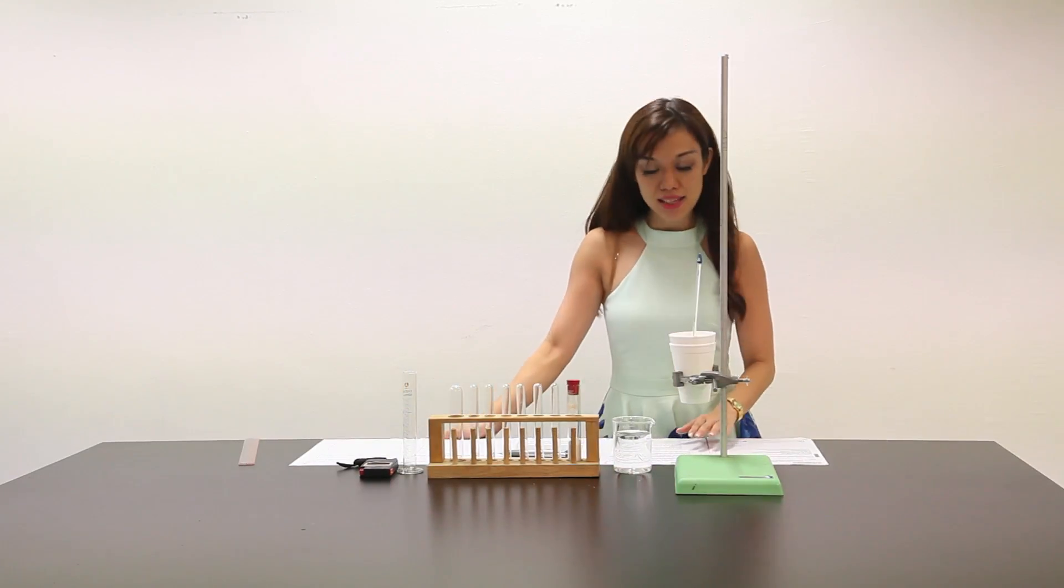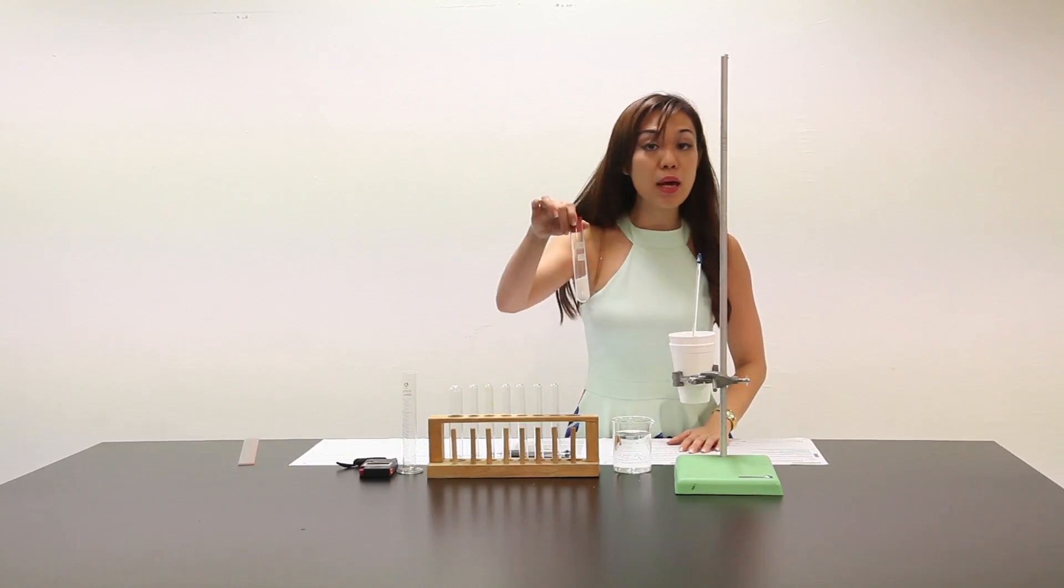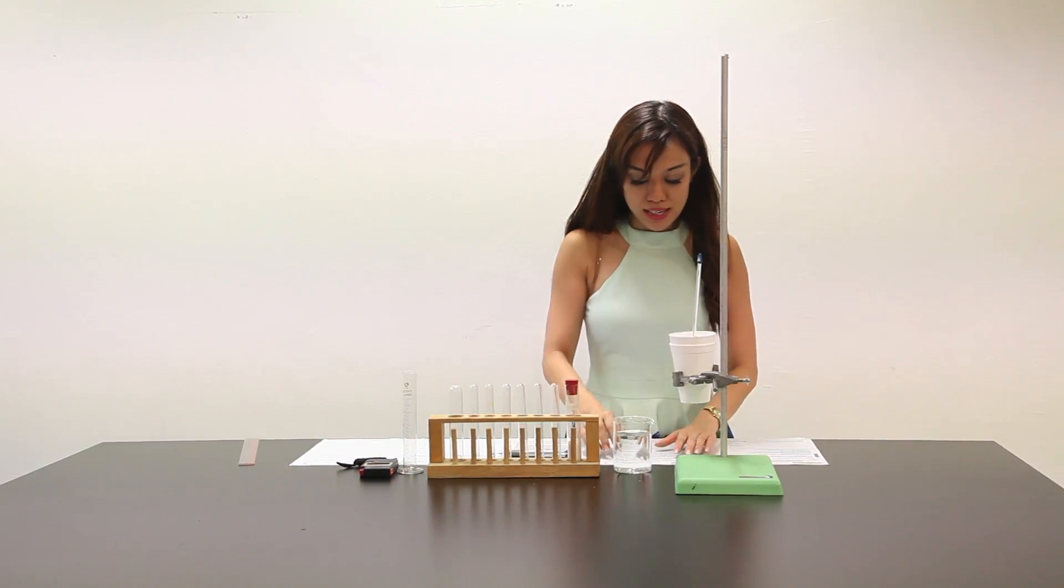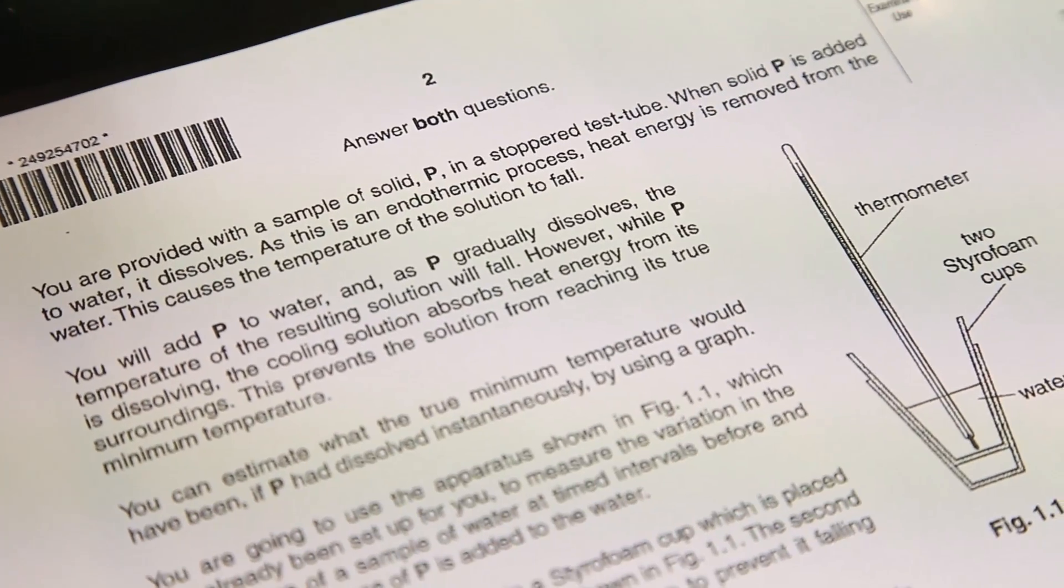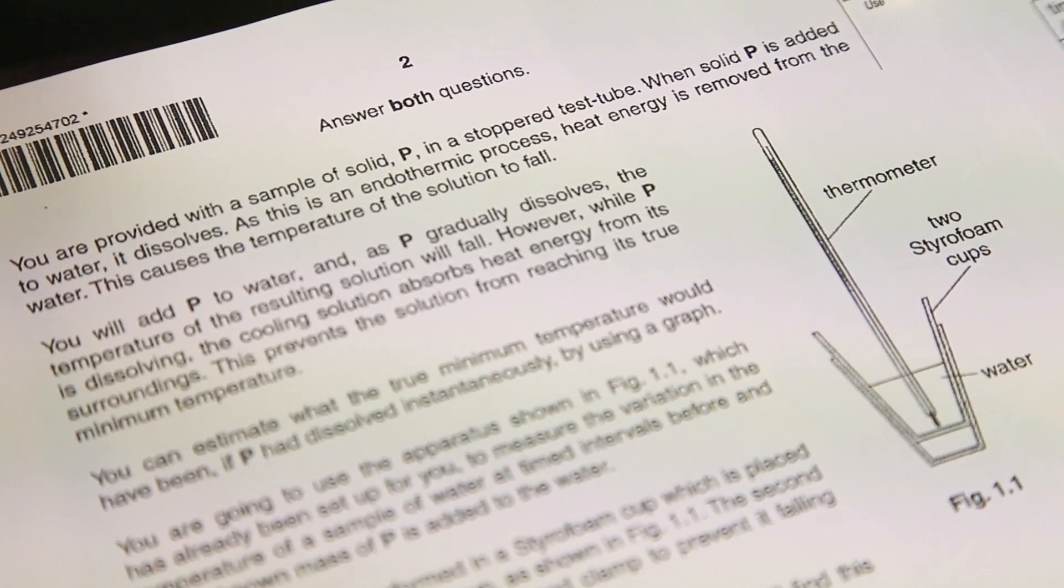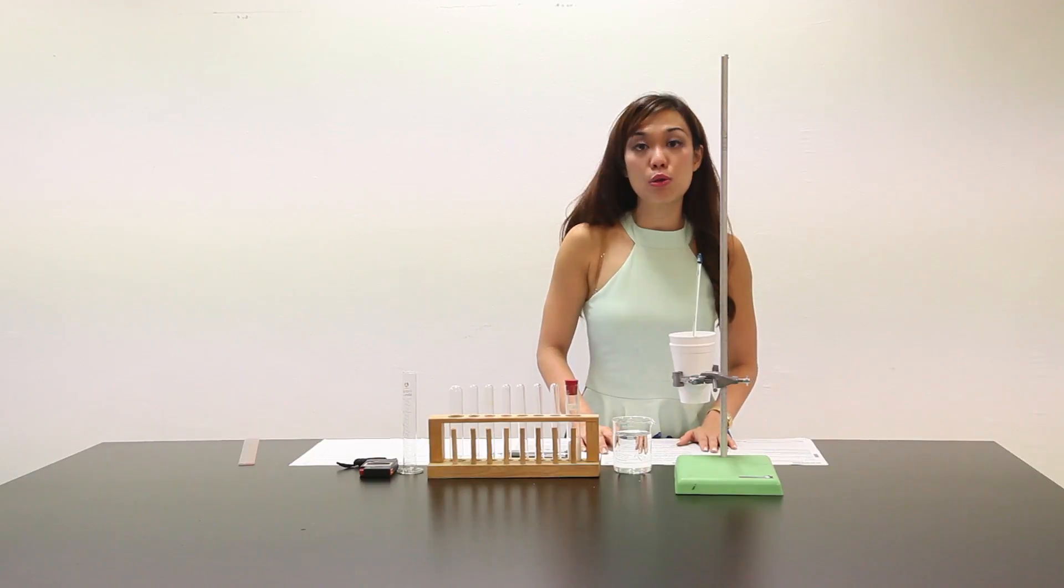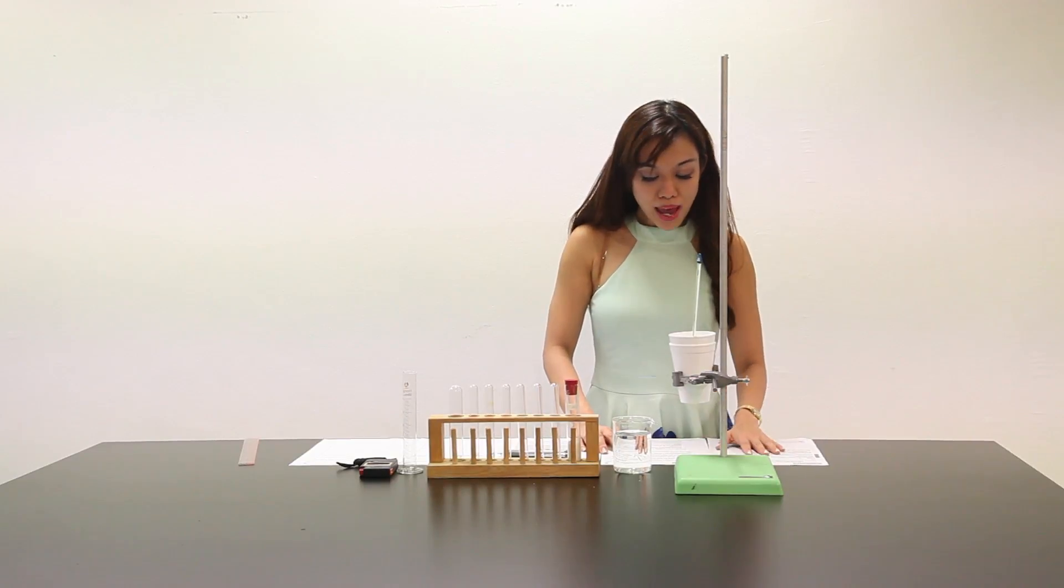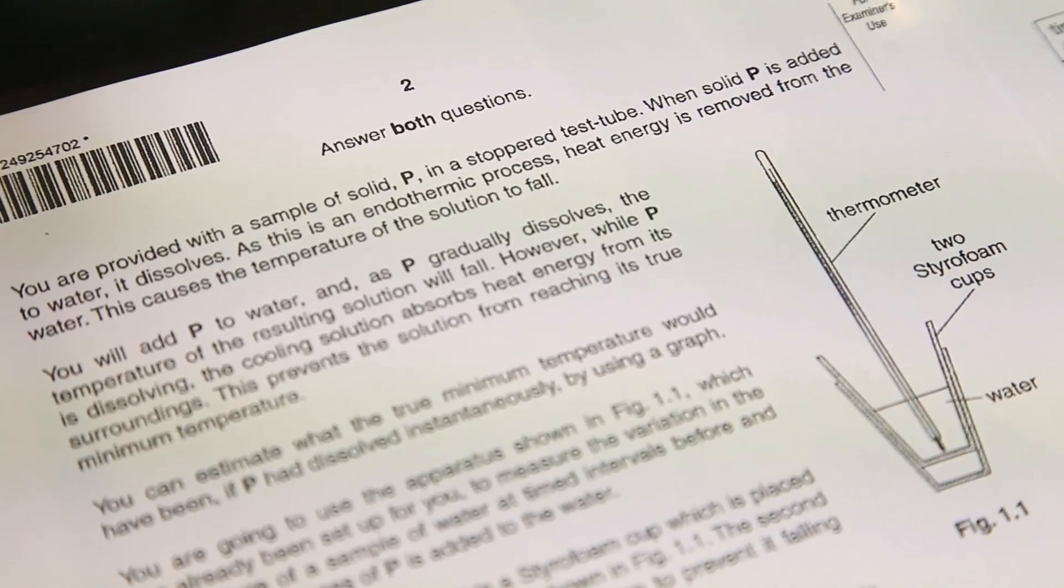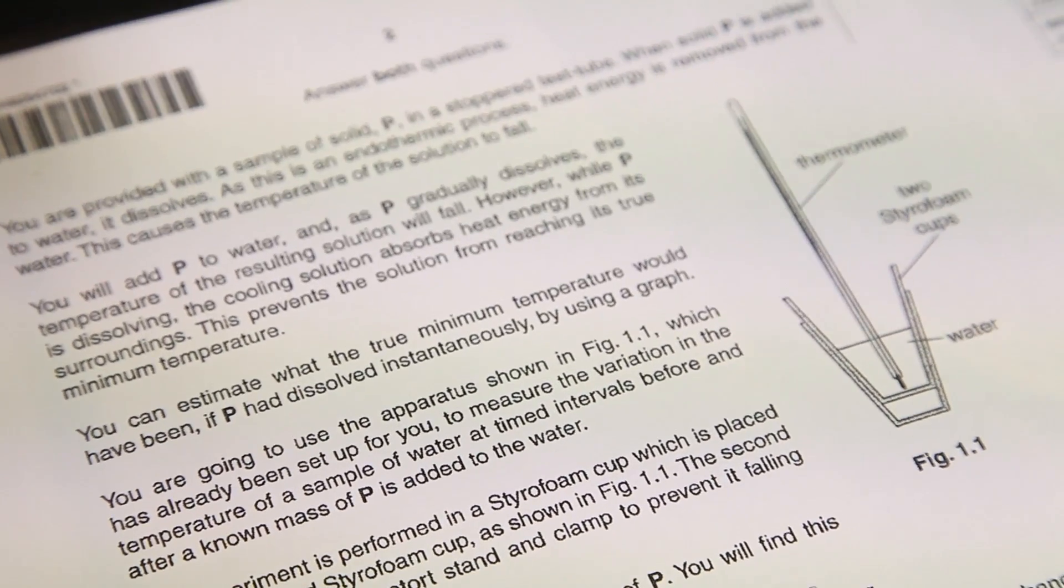The question says you are provided with a sample solid P. This is sample solid P in a stoppered test tube. When P is added to water, it dissolves. As this is an endothermic process, heat energy is removed from the water and this causes the temperature of the solution to fall. You will add P to water and as P gradually dissolves, the temperature of the resulting solution will fall.